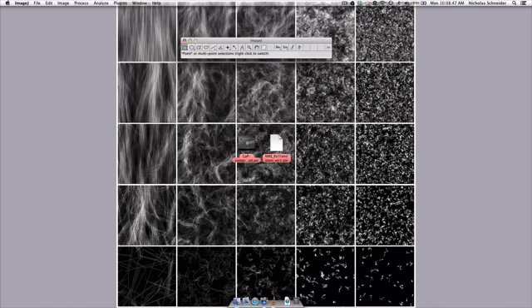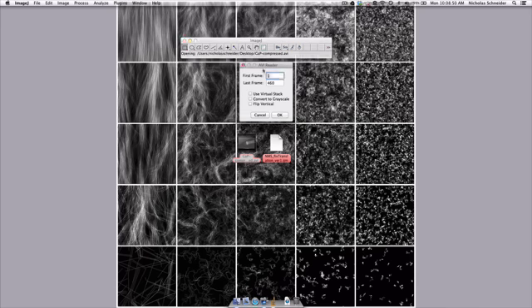Now we need to have a video to edit, so I'll bring in our nanowire video, and I'm just going to load the first ten frames for speed's sake, and I'll use a virtual stack and might as well convert to grayscale.